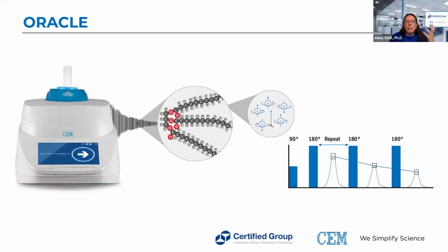If you're like, okay, well, you talked about these protons. Where are the protons in a sample? Well, the sample is going to have protons in moisture, fat, protein, carbohydrates. So how are we specifically singling this out? Well, I'll cover this in a moment. We are going to remove the moisture from the sample. Okay, so the moisture goes away. We still have proteins and carbohydrates that could interfere. Well, the proteins and carbohydrates, when looking at this specific CPMG TD-NMR, are going to relax at a faster pace than the fat. So we're able to separate them out and specifically look at the fat molecules.